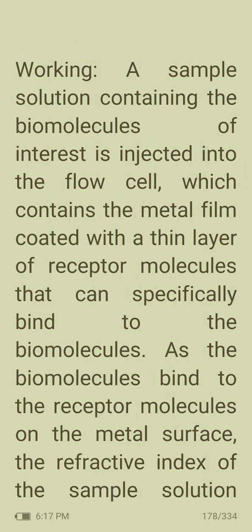Working. A sample solution containing a biomolecule of interest is injected into the flow cell, which contains the metal film coated with a thin layer of receptor molecules that can specifically bind to the biomolecule.